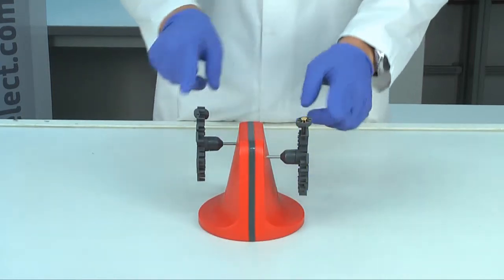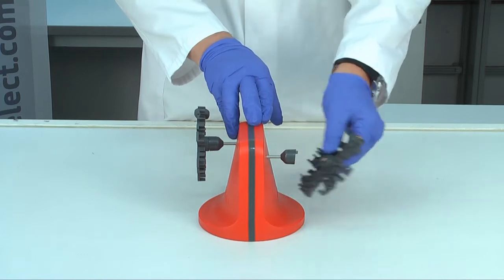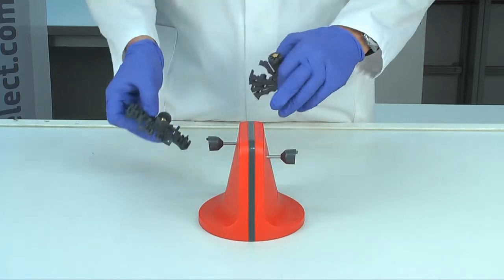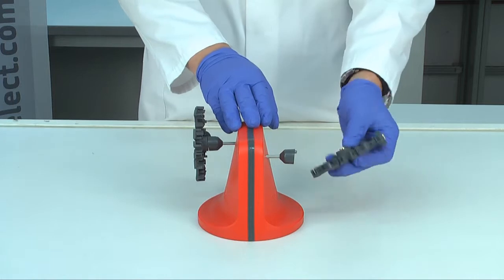For flexible sample mixing, Pluriplex has two arms with reaction tube holders. These can be attached in two ways: rotating sideways or overhead mixing.